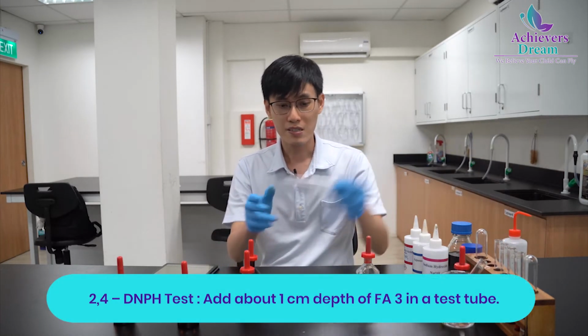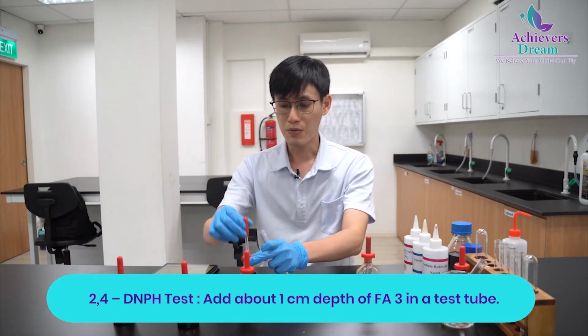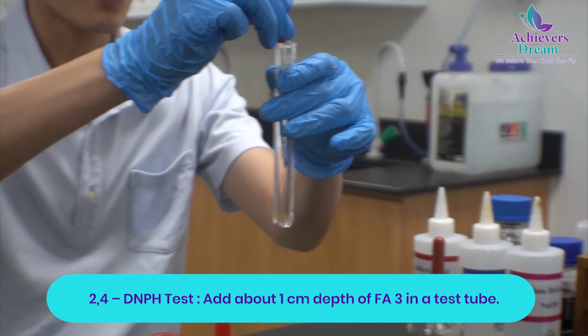Let's do the test now for FA3. So I have some FA3 here. I'll be putting 1 cm depth inside the test tube.